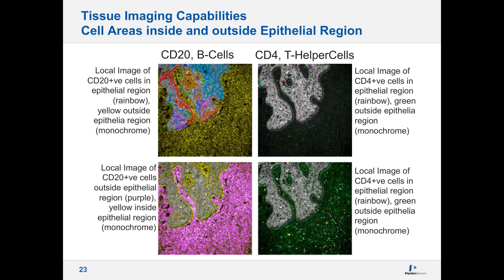Thinking about inflammation from tumor invasion, you have this immunological response, and you can start to look at cytokines, chemokines, and other phenotypes, other CD markers, including HLA-DR. So I think it opens up a lot of opportunities for the community. Also, you have to think about this: the only way to do this is with intact tissue.